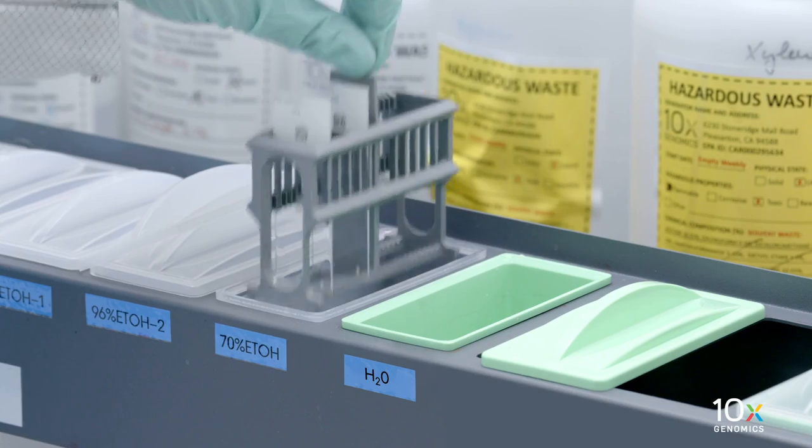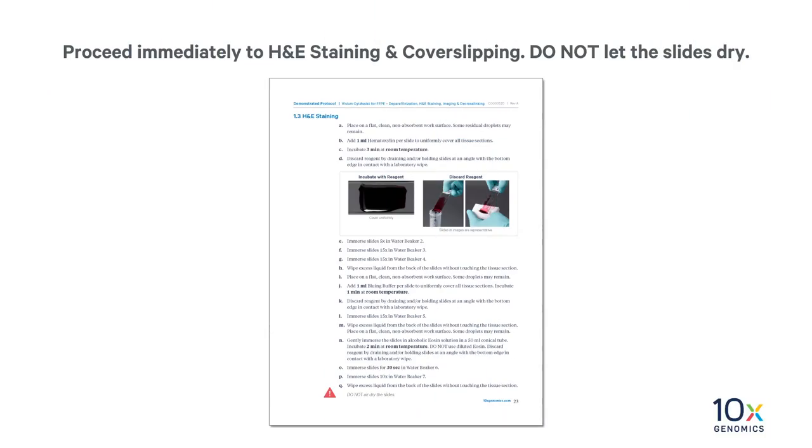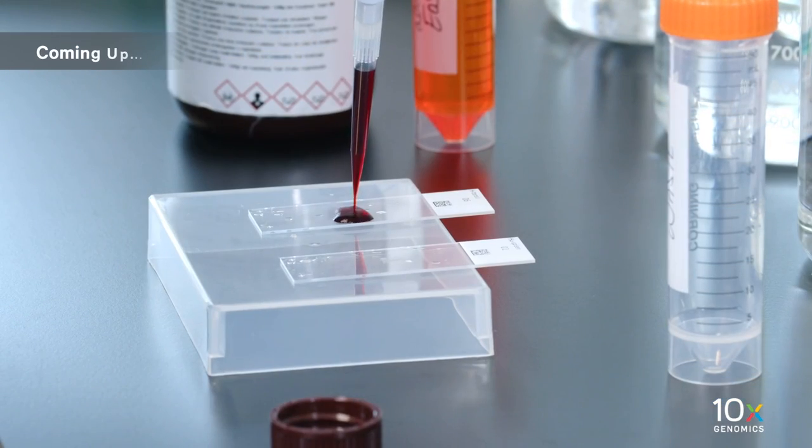Finally, gently immerse the slides in the water and incubate for 20 seconds. Proceed immediately to H&E staining and cover slipping. Do not let the slides dry. We have completed tissue deparaffinization. Next, we will stain the tissue.